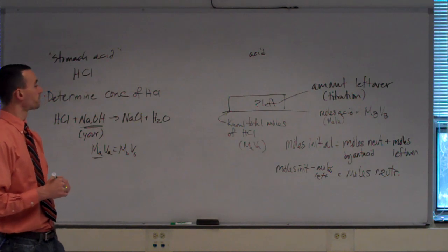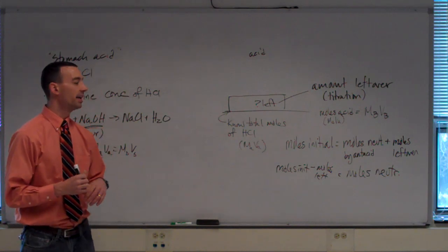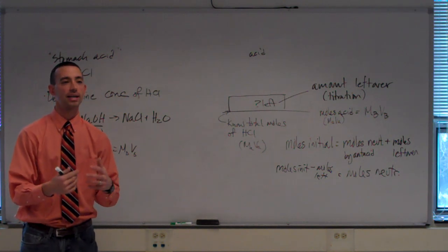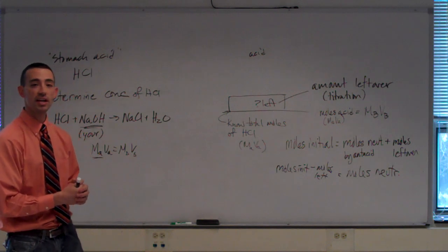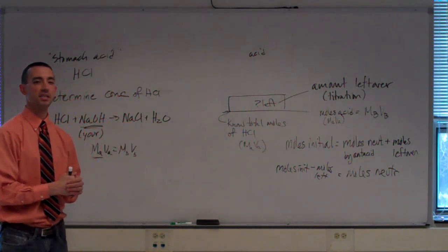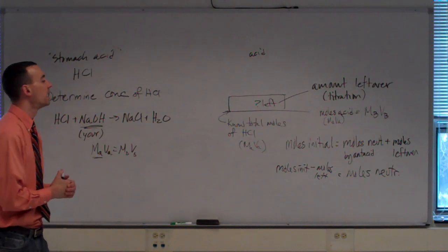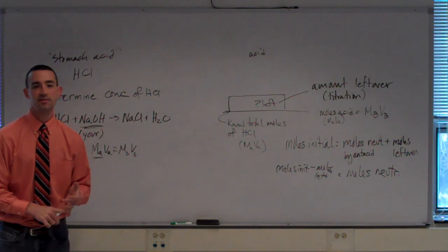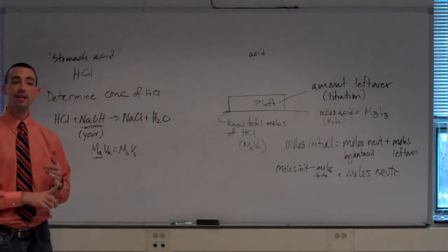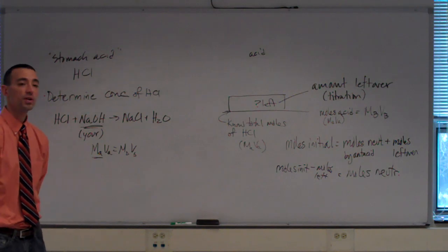Right? The safety concerns that you might have to think about today: you are working with acid and base, so you don't want to splash them around or get them splashed onto your skin or your clothing. They can stain your clothing, and if you have sensitive skin, the acid and the base might irritate your skin as well. Be sure to wear your safety glasses, of course, but otherwise the safety hazards are fairly minimal in this experiment, and this one should go pretty well.